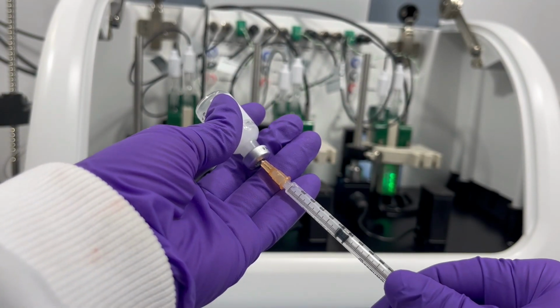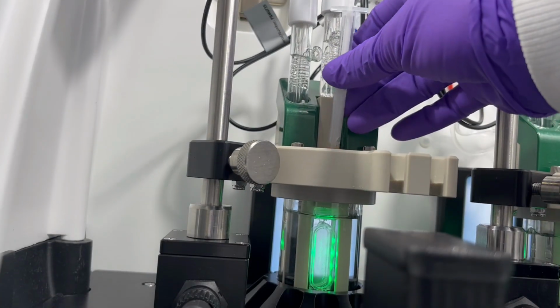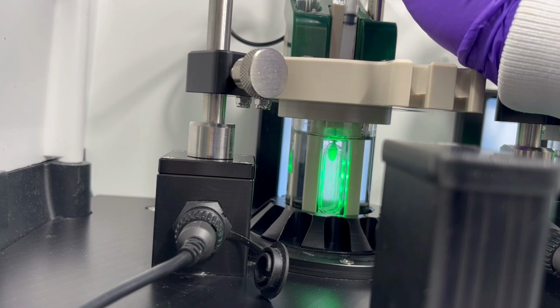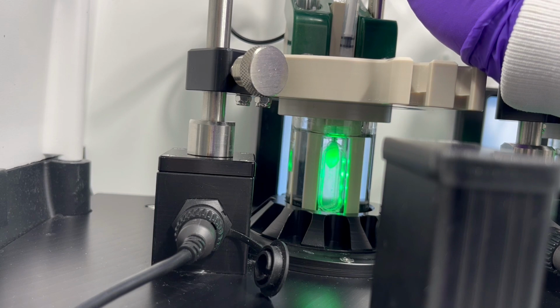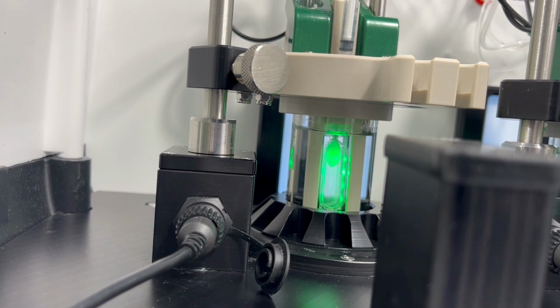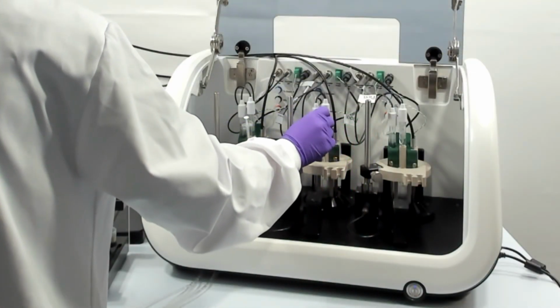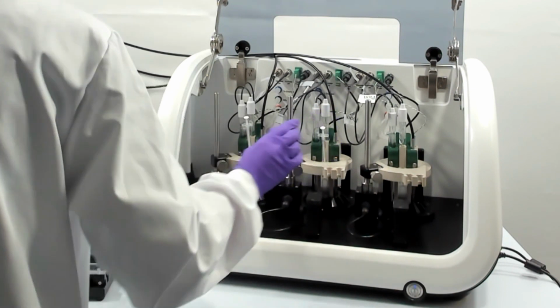And this is where we'd get our injectable ready, and we can inject that via the port at the top of the system. We can do this manually, and we can also do this with an auto injector as well. We normally slow our injections just due to the size and shape of the system, allowing us to get that nice depot upon delivery. And then we repeat that for our subsequent assays as well.